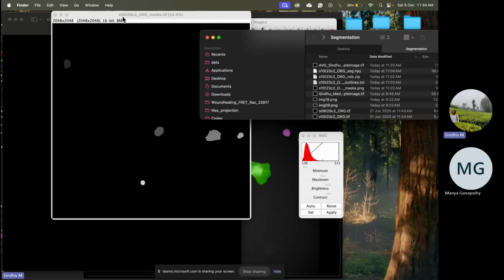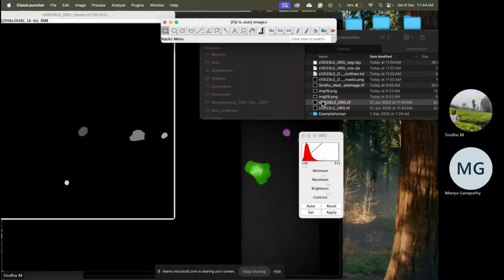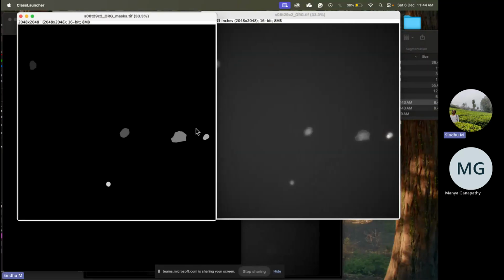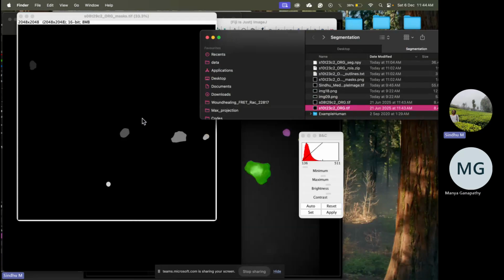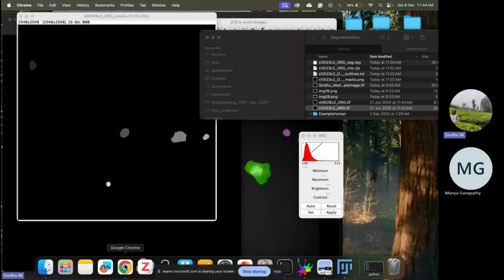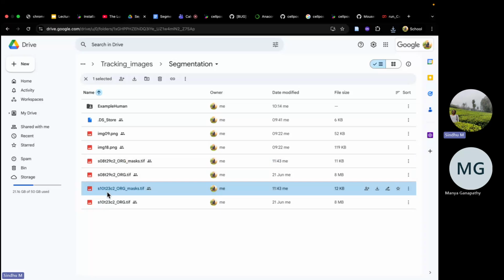This is SA-T29, this one. Yeah, so it has done the segmentation properly. So in this folder, I just had 2 images, but if you had many images, then if you just run the code and leave it to run, then it will finish it for all the images. So similarly, it has also given the mask output for the next image.